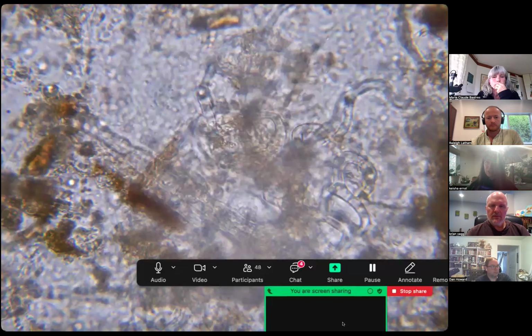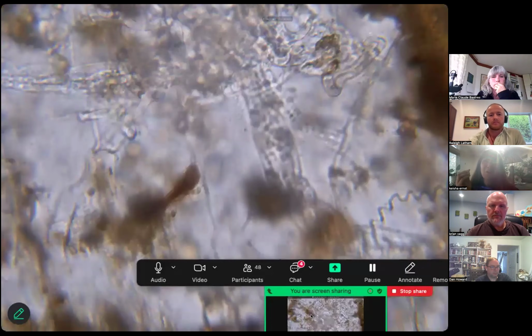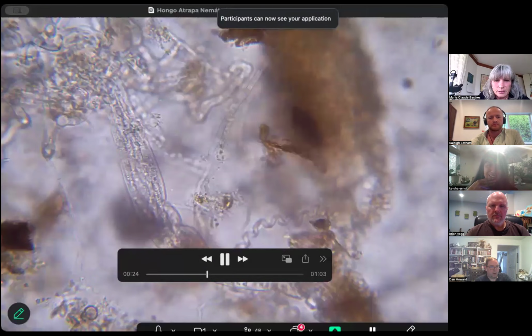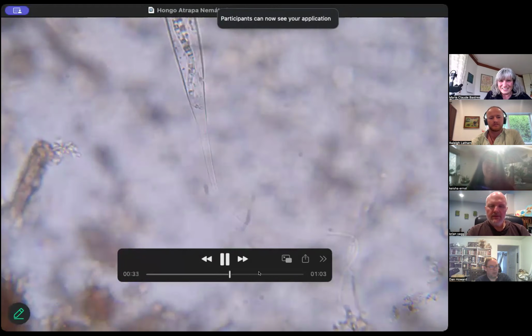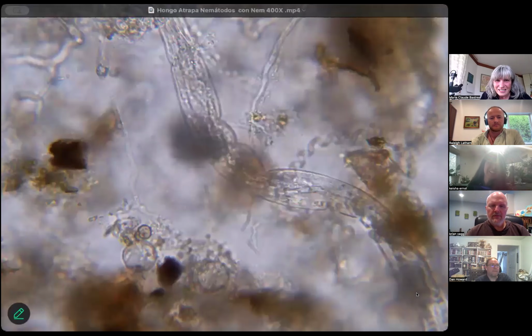When we're looking at the morphology of the organisms, oomycetes would typically look kind of messy, not so structured, messy, bubbly. You'll often see their spores right on the hyphae. Can you see that? Yeah, it's got a real oomycete look. It makes me want to deep dive into it and see how many oomycetes are actually known to be trapping nematodes.